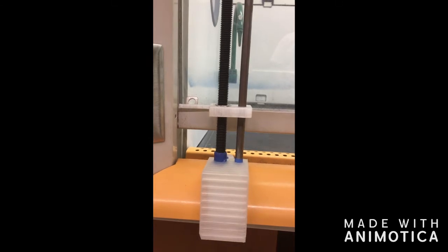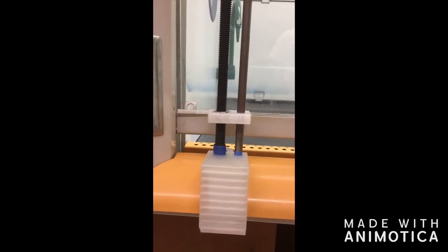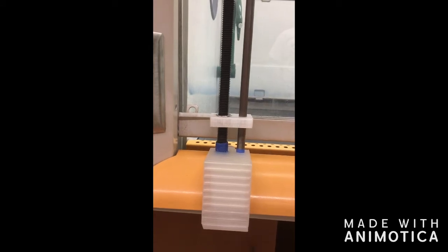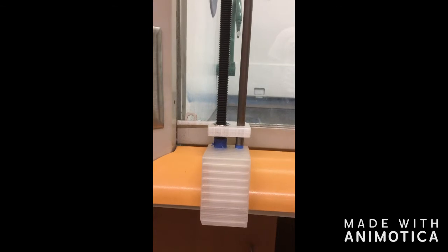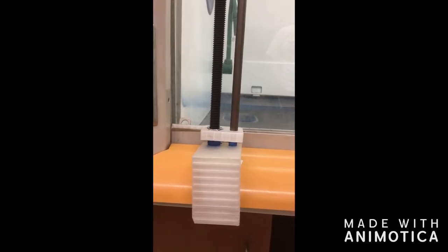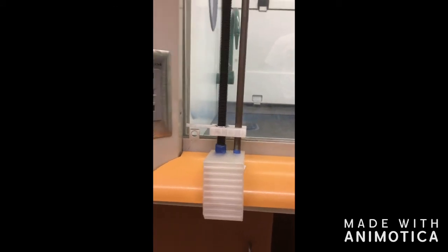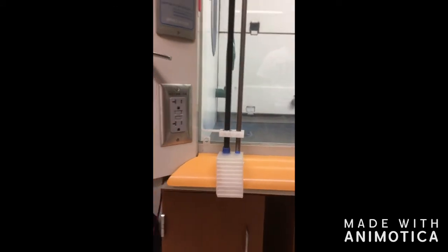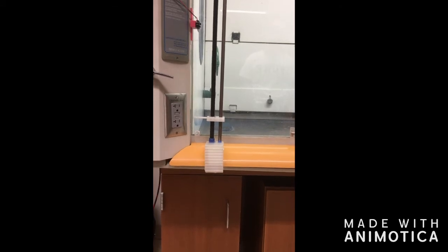Ease of installation was a major design criteria first outlined by our original client. The device should take less than 30 minutes for 3 people to install. The first time we tested this, it took more than 45 minutes for 3 people to install. However, every test since took less than 20 minutes. This criteria was not just met by increased familiarity with the installation process, but also with changes in attachment methods. Though we did not test ease of installation for one person, we suspect that it should take less than 90 minutes for one person to install.